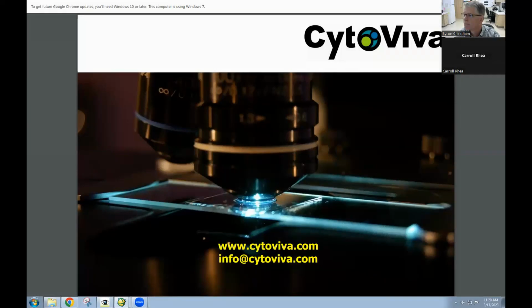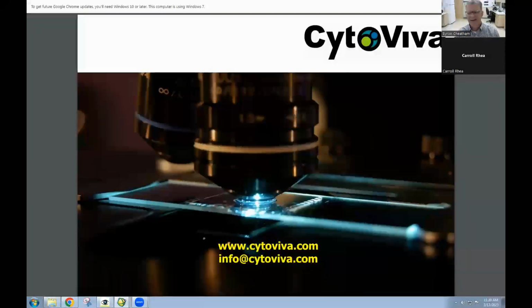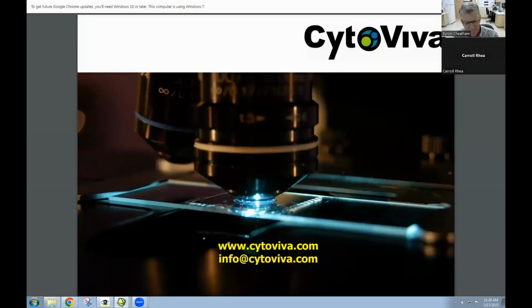Okay, last but not least, is it possible to analyze tissue samples embedded in resin? It is. The resin is a mess, quite frankly, from a spectral scattering perspective, but it can be done, and we have done it. The key to any of this is to have proper controls. I always like to use the analogy that if I'm looking for needles in a haystack, it's always best to start with lots of needles in the haystack, my positive control, and to start with a known negative control. So if I'm looking for something in tissue embedded in resin, then for our nanoparticles, let's look for a heavy dose first. And then the negative control needs to be the tissue and the resin.